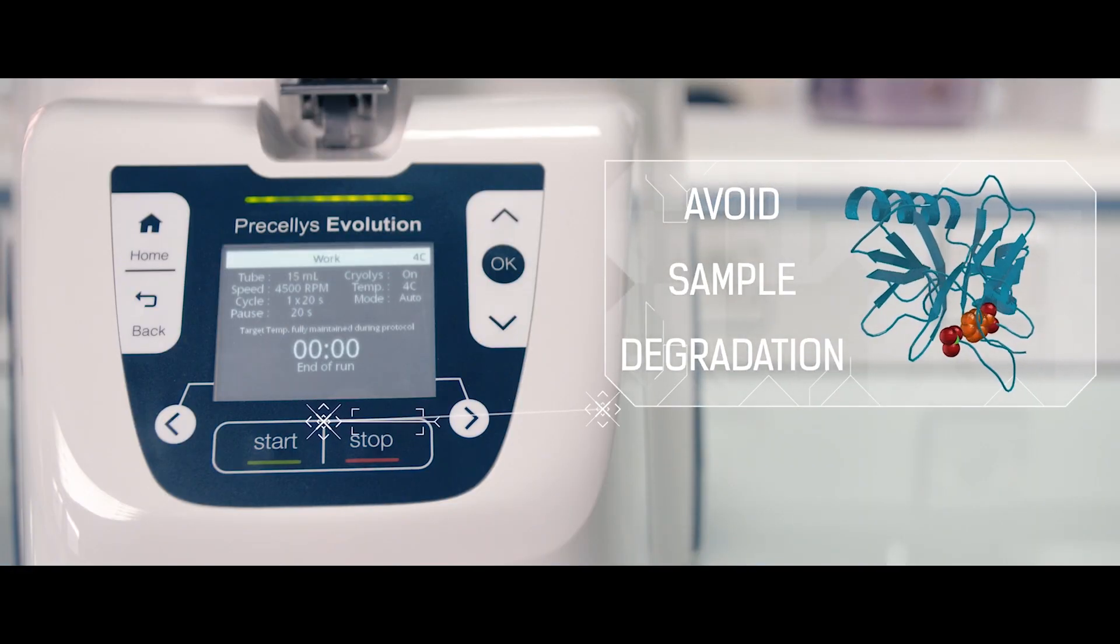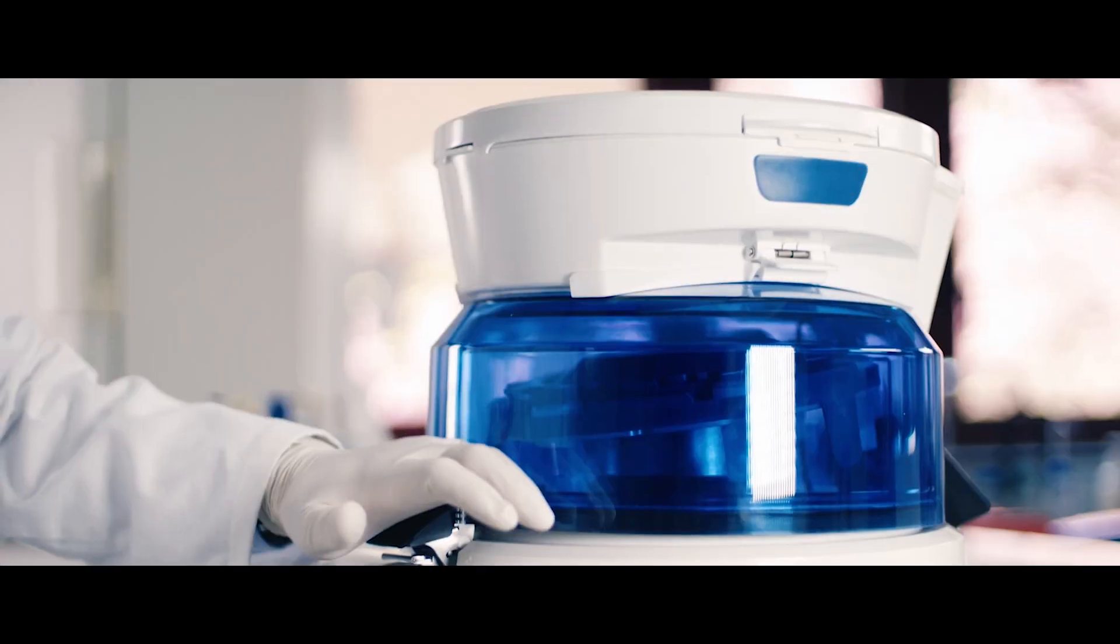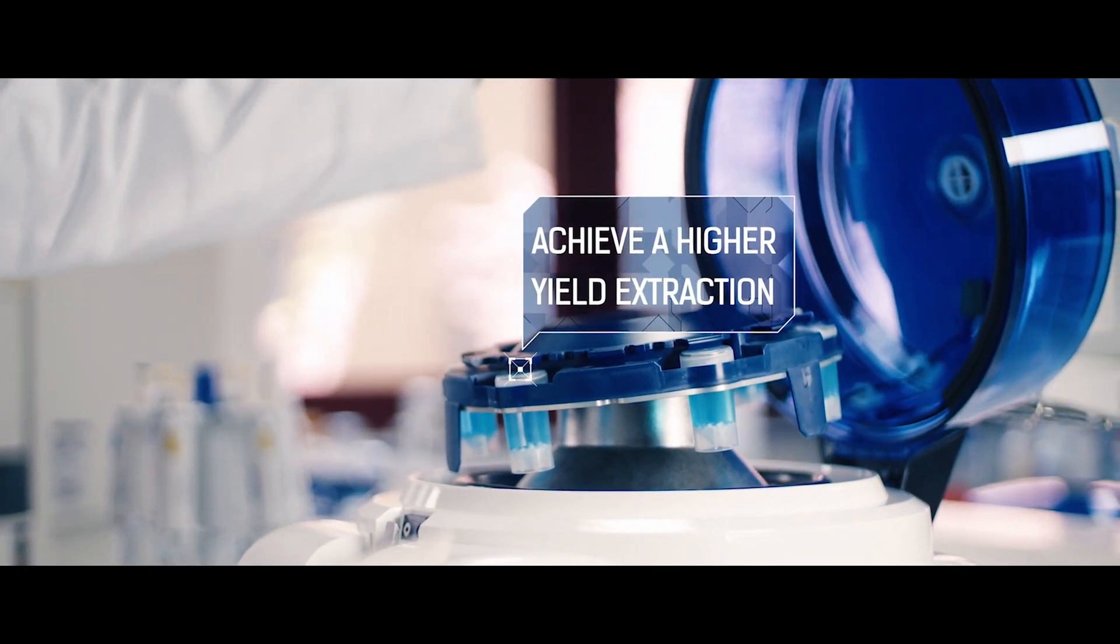Cryolis Evolution protects your samples from heat degradation and guarantees the best yield extraction for RNA and proteins.